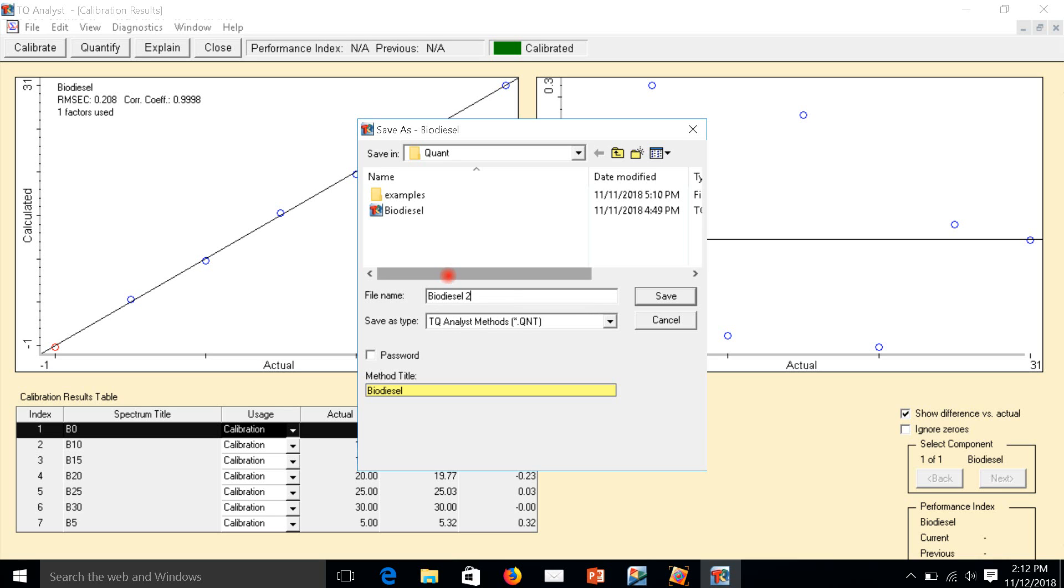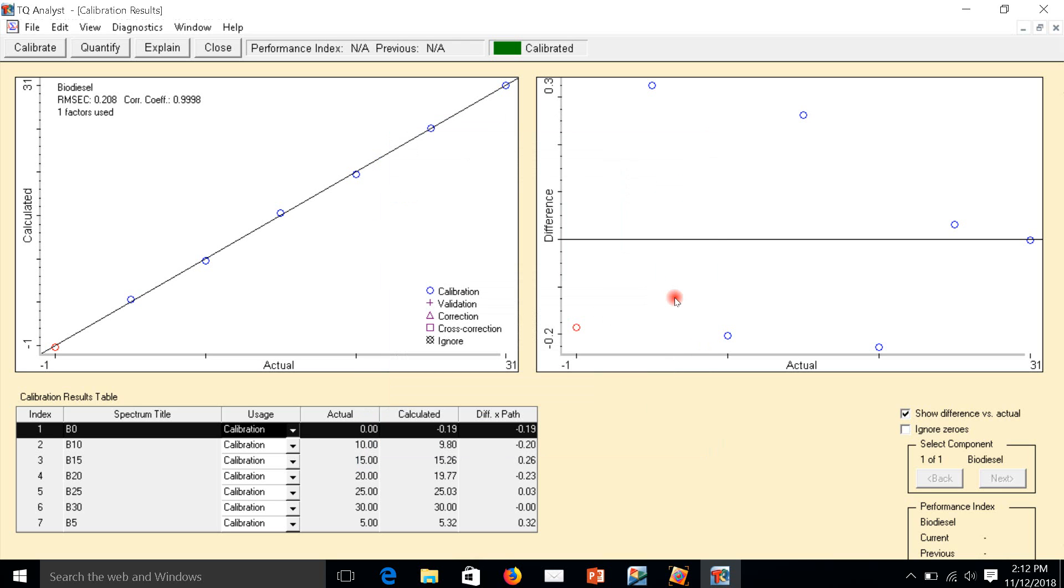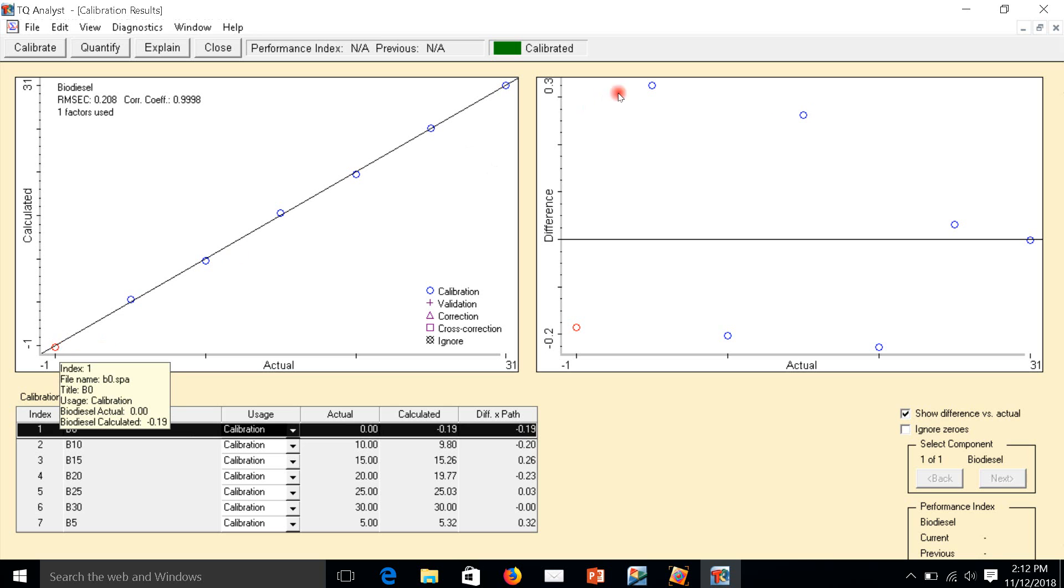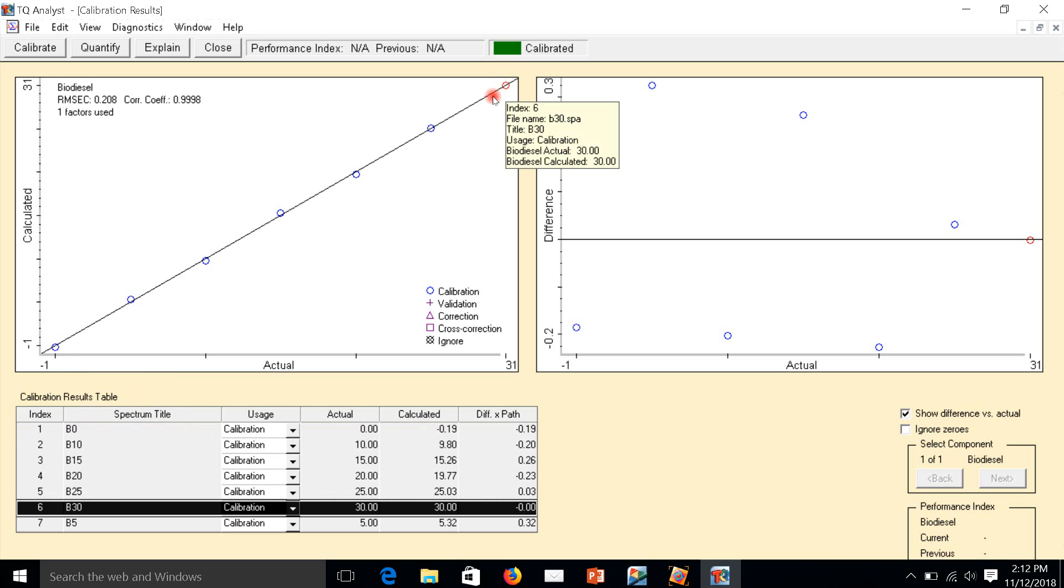I already have the calibration curve from zero to 30 concentration.